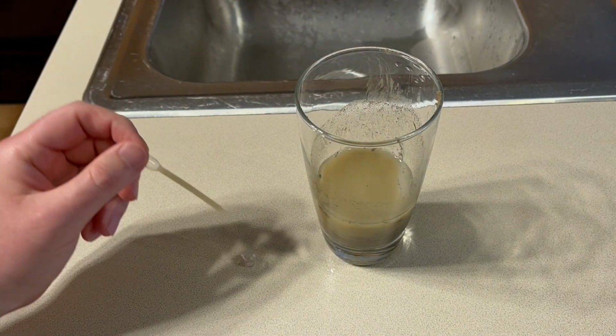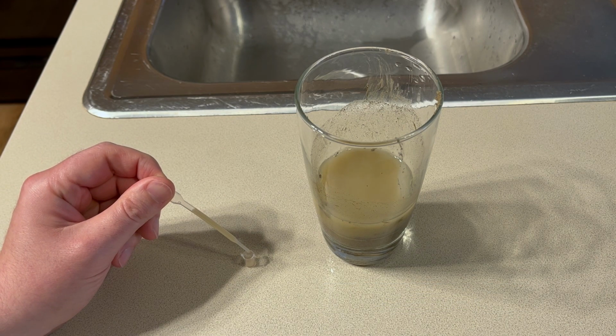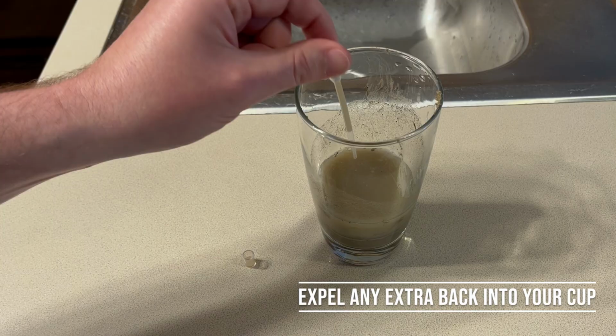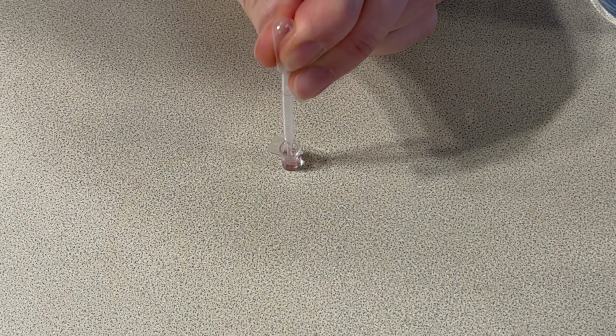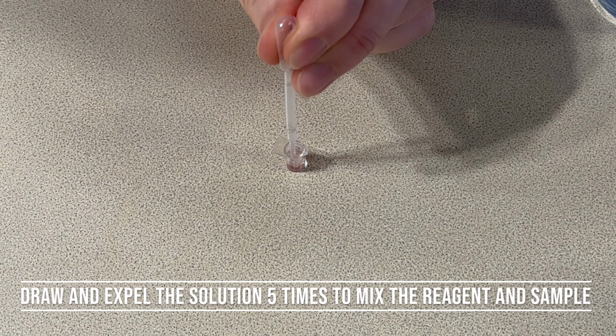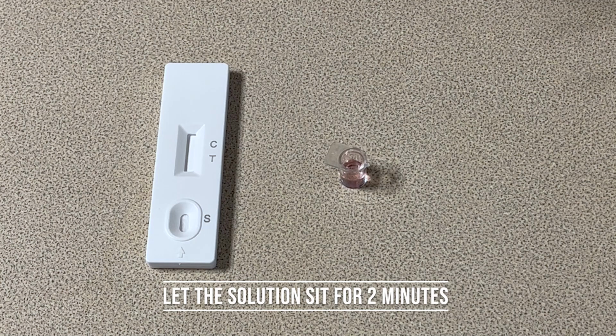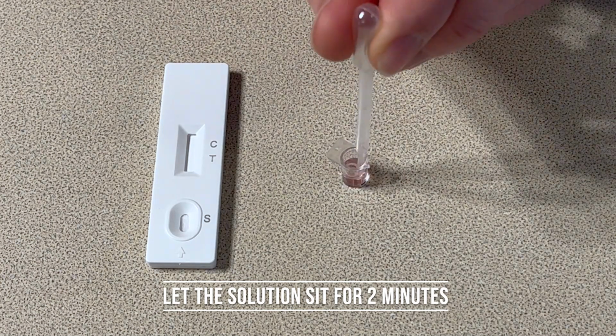Use the pipette to transfer exactly 4 drops of water from the upper part of the sample into the microvial. Then use your pipette to draw up the solution and expel it back into the microvial 5 times in a row. This will mix the reagent and the sample water. After mixing, let the solution set for 2 minutes.